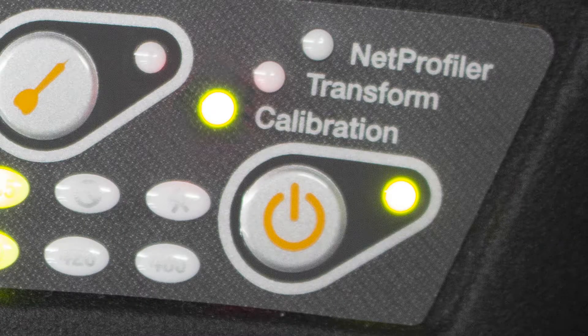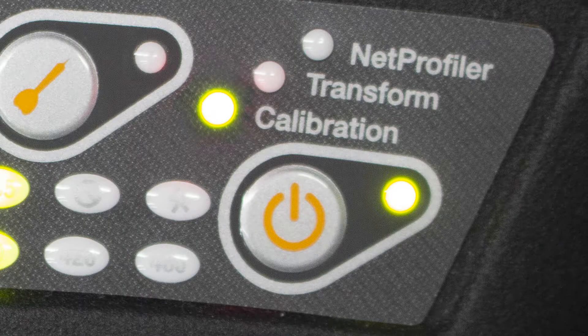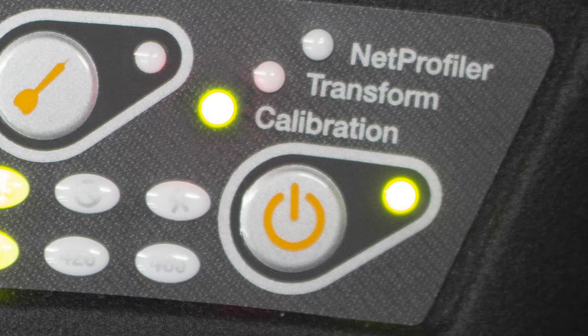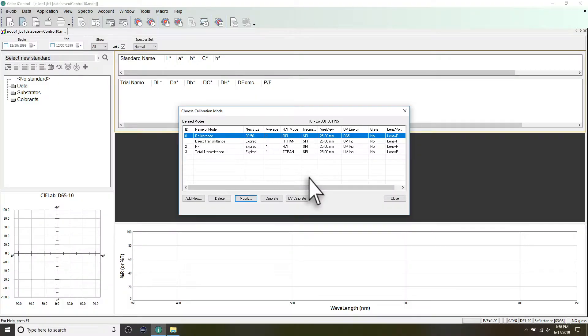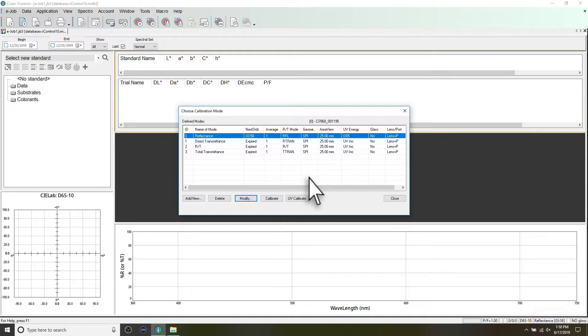Once calibration is complete, the instrument's calibration light becomes green. Your status bar will also update with the time left before another calibration is needed. Any change to your configuration at this point will result in the need to recalibrate your instrument.